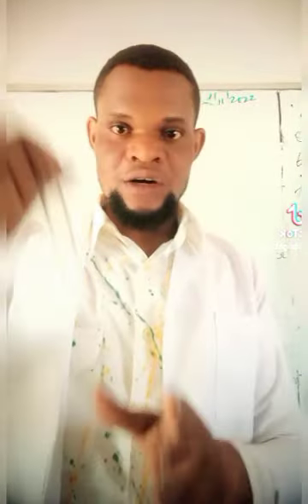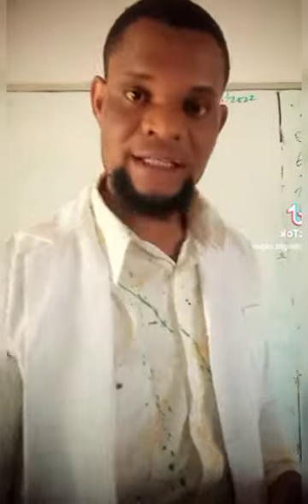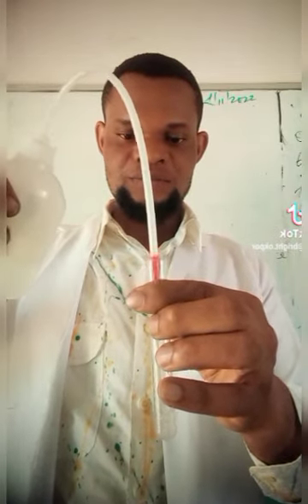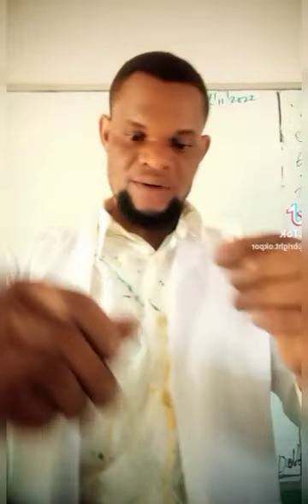So this is one, so I'm going to keep it and take another test tube for the other compound, which is potassium iodide. I will also put a little quantity inside test tube B. All right, and also use the distilled water to dissolve it as well, and shake vigorously to ensure that the particles are well dissolved. So that's what I'm doing, to dissolve them completely.